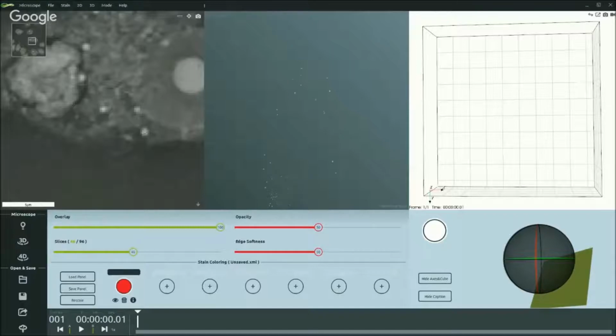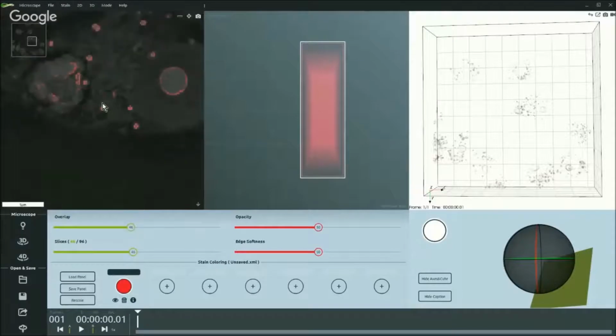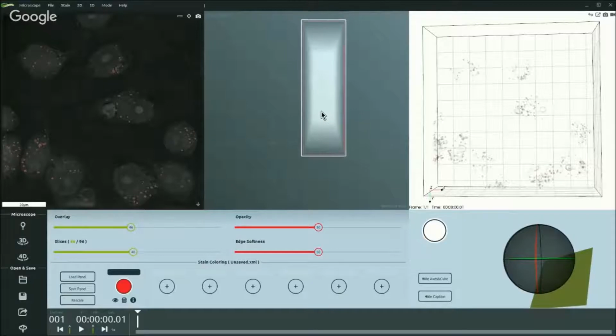So what happens if I go here and I paint those pixels is that all the pixels in the area that have that specific combination of refractive index and gradient are highlighted. If you are not happy with how the selection was, you can move it afterwards.